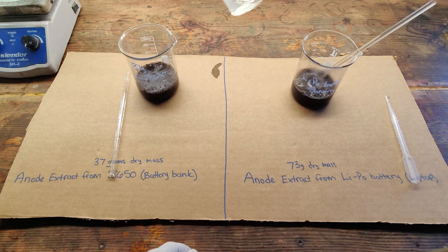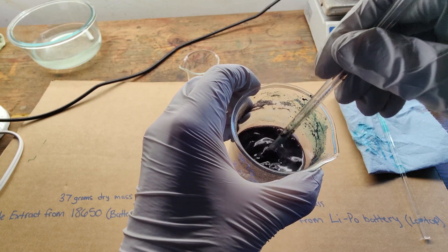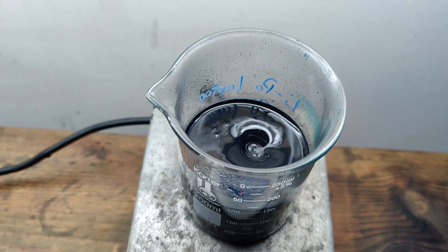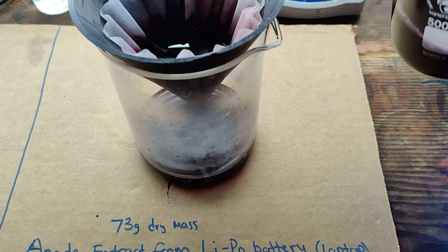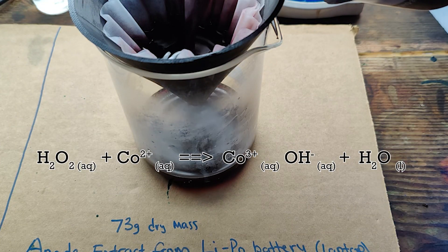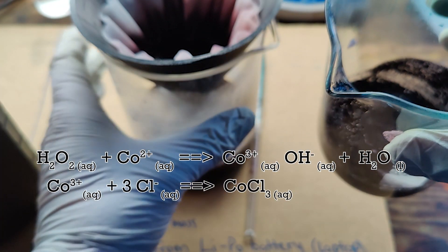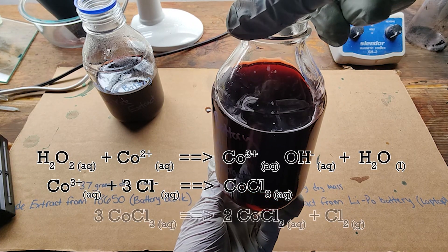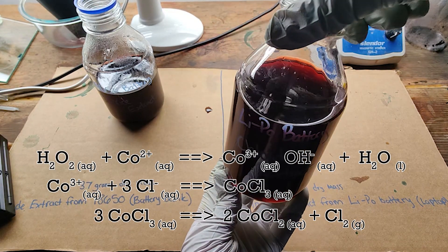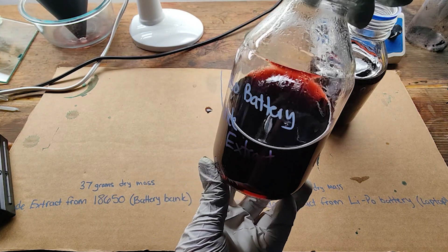Now that I had hopefully removed all of the aluminum from the cathode material, I can dissolve my black mass into some hydrochloric acid. I added hydrogen peroxide out of habit with the intention of helping the reaction along, which in hindsight was pointless because the metals should already be in their oxide forms. But in reality, this was actually counterproductive. What I believe happened is the hydrogen peroxide actually acted to oxidize the divalent cobalt ions into their trivalent forms. Trivalent cobalt reacts with chloride to form cobalt(III) chloride, which is extremely unstable and immediately decomposes to produce cobalt(II) chloride and chlorine gas. As a consequence, I probably ended up using considerably more acid than was necessary and heavily diluting my solution for no good reason.